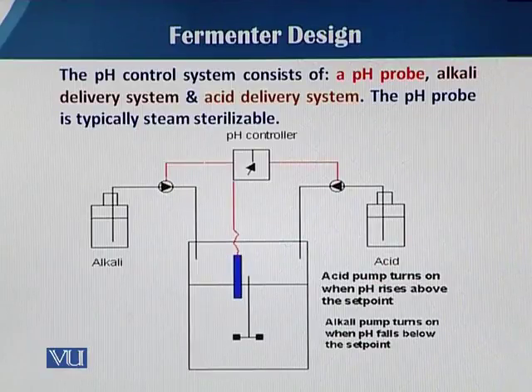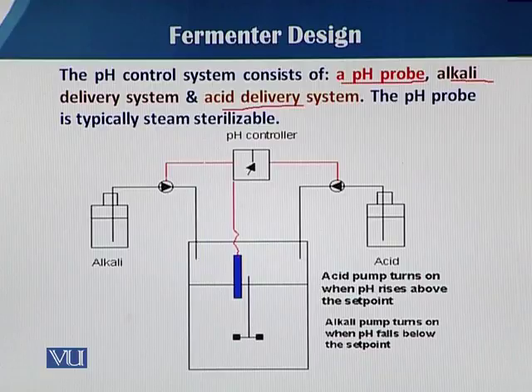In this case, the pH control system consists of a pH probe, and this pH probe is very sensitive to temperature, because we have to use pH probes which can withstand the sterilization temperature, meaning 121 degrees Celsius. Normally, the pH probes and pH meters used in a laboratory cannot withstand such a high temperature. So the pH probe used in fermenter vessels is made of a special material. Then there is the alkali delivery system, and then the acid delivery system.